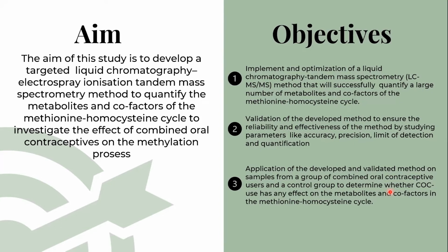To achieve the aim, the following objectives are important. Firstly, the implementation and optimization of a LC-ESI-MS-MS method. Secondly, the validation of the developed method. And lastly, the developed and validated method will be applied to combined oral contraceptive users and a control group to investigate how the methylation cycle is influenced by hormone use.